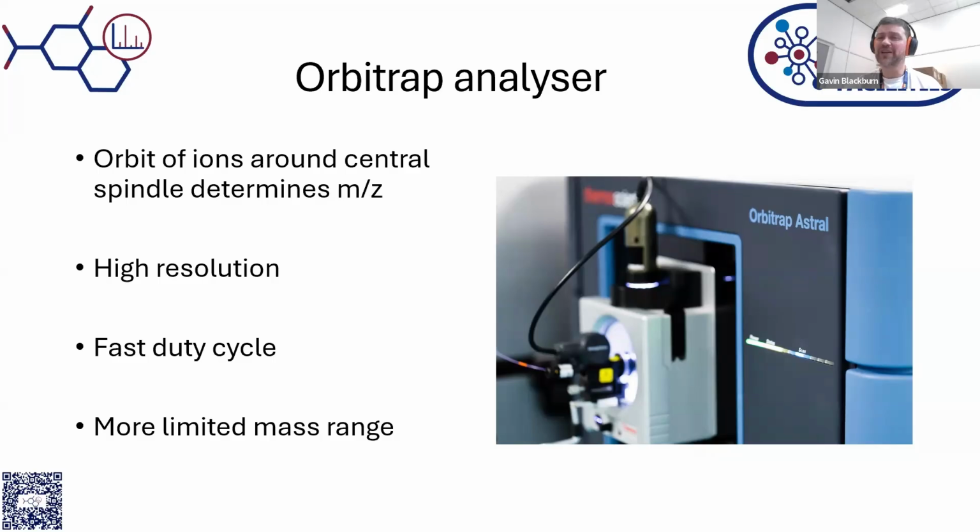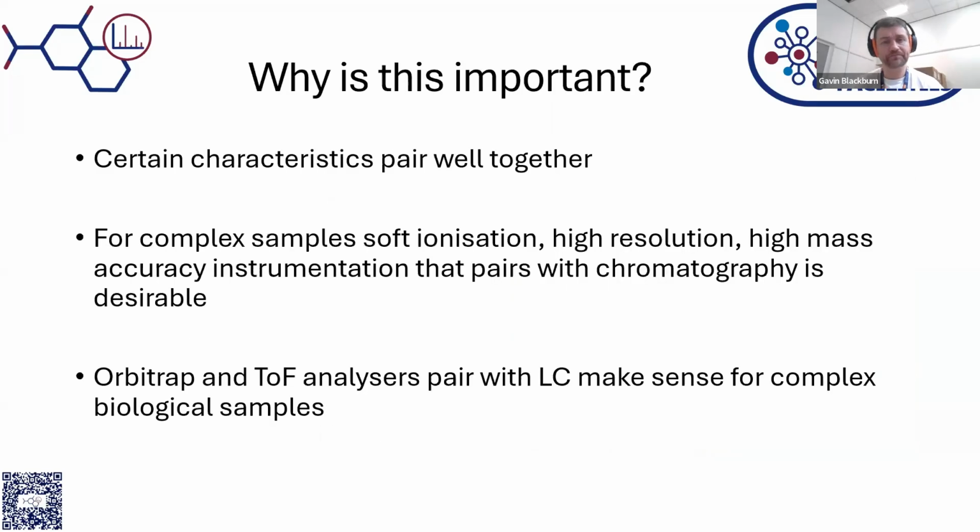Proteomics, as a note, really does follow the developments in mass spectrometry more than metabolomics and lipidomics do. And in fact, you can use older instruments for metabolomics and lipidomics and still produce absolutely fantastic data out of those, although we are very lucky that the college has invested within mass spectrometry, so we have new modern instruments that we can use with some additional extras that we'll talk about in other webinars.